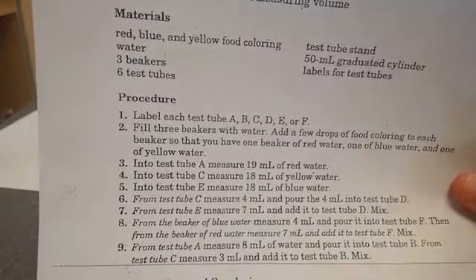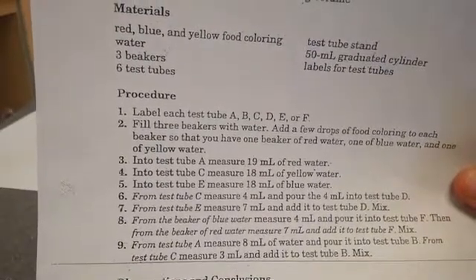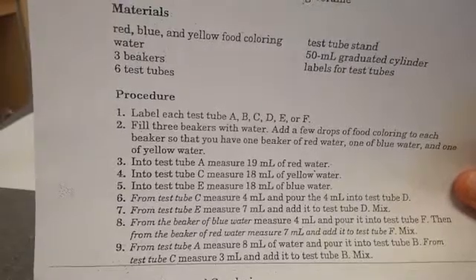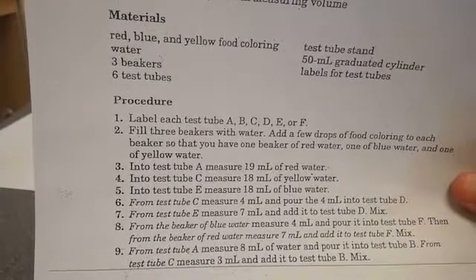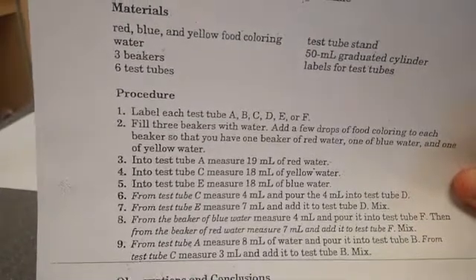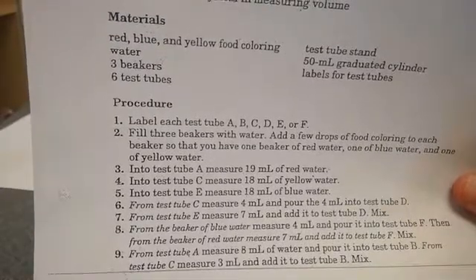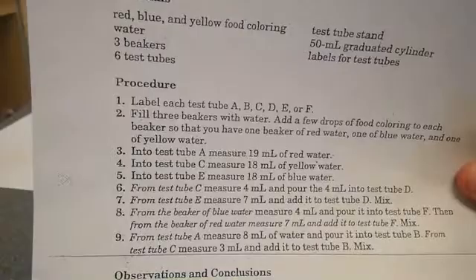That's already been done. And step number 2 was to add food coloring to 3 different beakers of water so that we have red, blue, and yellow. We're going to go ahead and start the lab, so I'm going to work my way through step number 9. You won't record any of your data on the data chart until after we get to step number 9.